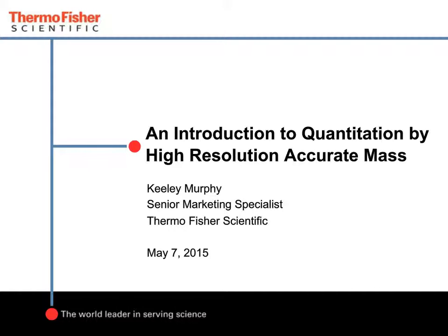Thank you, Trevor. Hi, everyone. Again, my name is Keely Murphy, and I'm part of the Strategic Marketing Group here at Thermo Fisher Scientific. Today, I'll be providing an introduction to quantitative analysis using high-resolution accurate mass, or more specifically, using our benchtop Orbitrap mass analyzer called the Q-Exactive.